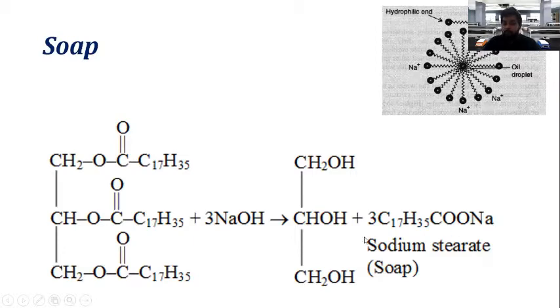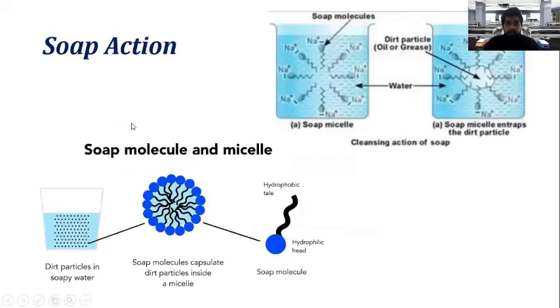Okay, so if you see the soap action, as I mentioned, this soap or detergent contains sodium stearate or sodium palmitate. It means it contains a hydrophilic head as well as a hydrophobic tail.